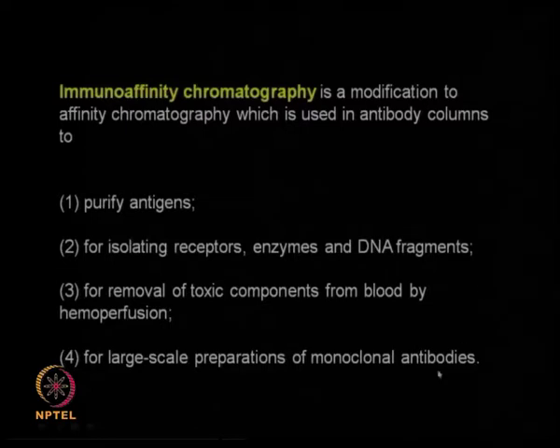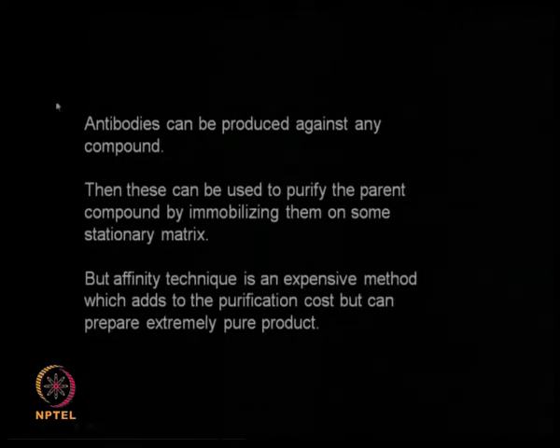For such antibody type of purification we use immunoaffinity chromatography.